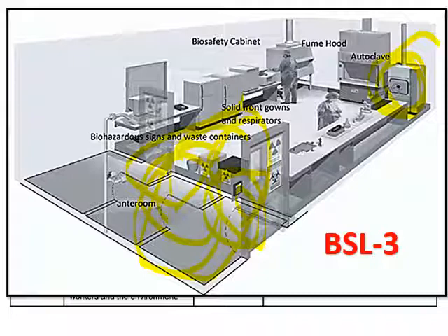But the idea is that if the technician is going to send something out of the lab, she's finished working with it for the day, she opens the inner door, puts it in there, turns on the autoclave, and then she comes out. When she comes out for the day, she takes it out and throws it in the garbage. Now, in order to get out, you have to take a shower, right? To get in, you can be dirty from the street, but when you come out, you have to take a shower before you're allowed to leave.